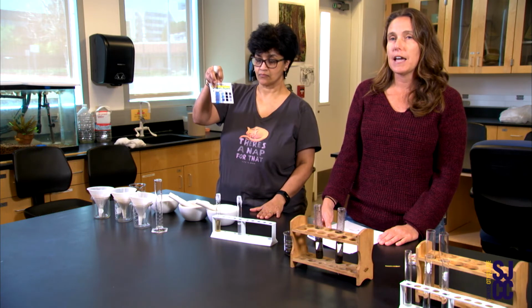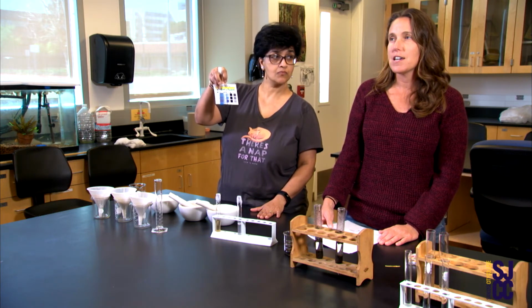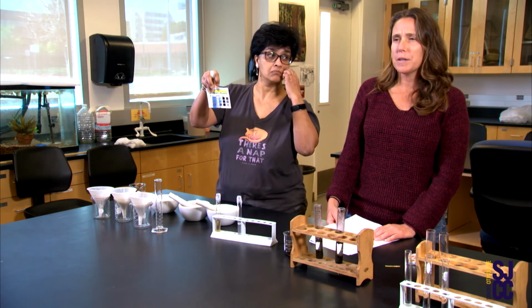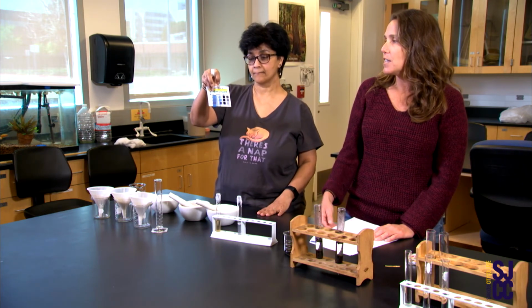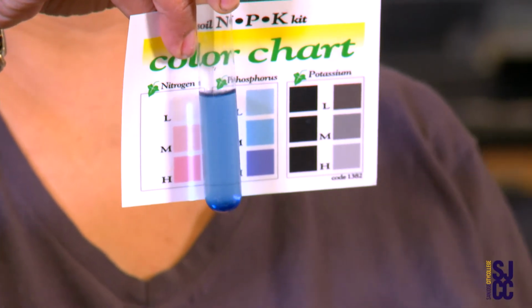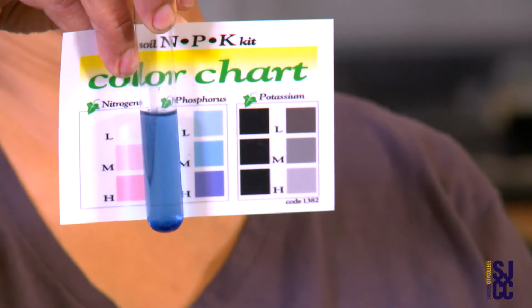But we can add supplements to increase our phosphorus by adding bone meal into our soil, which is another good supplement. And as you can see, we have a deep, rich blue, which I would say is on the medium to high, right? So it's a really vibrant blue.